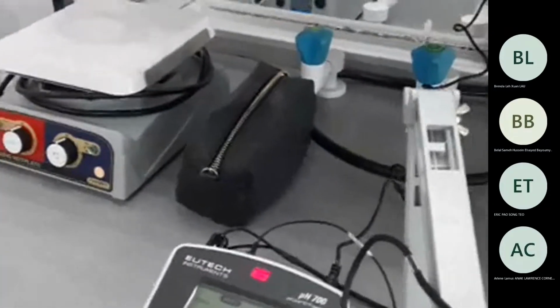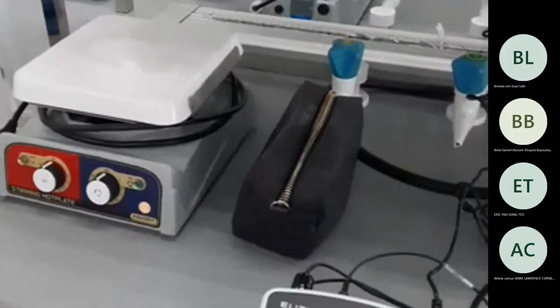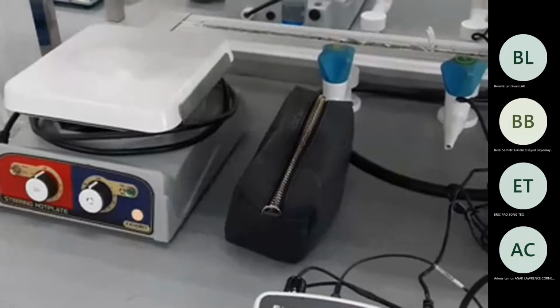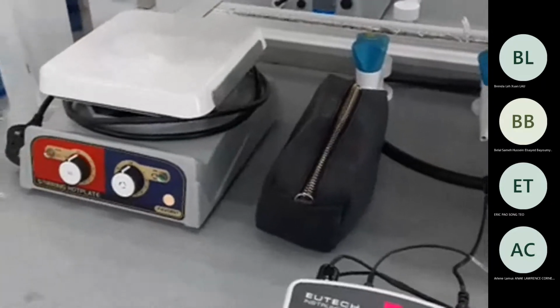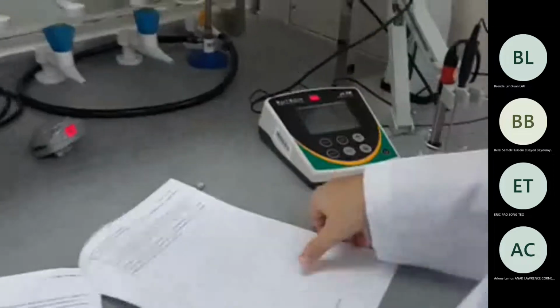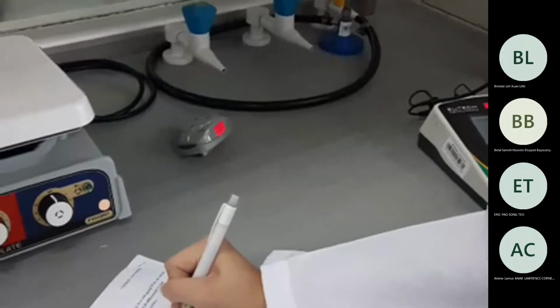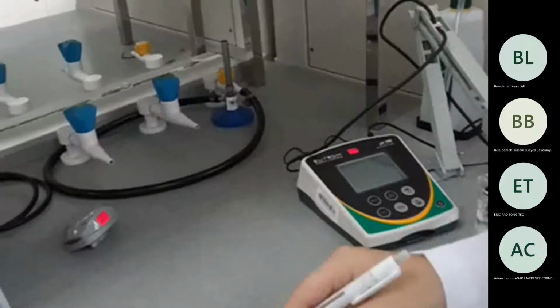So let's see what Noor is doing here. Is it distilled water or pH? I mean, this is distilled water. And your distilled water is 6.43. Okay, so you have to record the reading. 6.43. Yeah, just do it. And now you can take the tap water. I don't know. How much is yours? 5.44. 5.5 now. Wait a bit till it becomes ready.